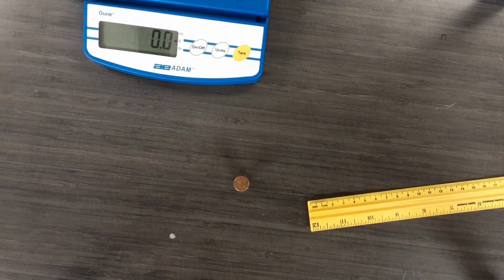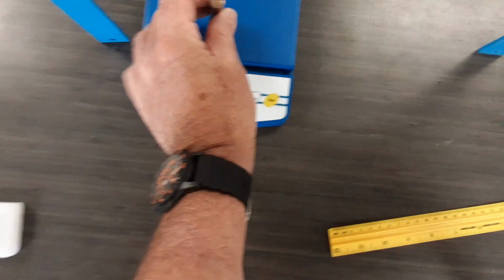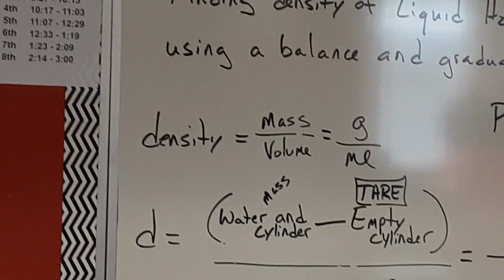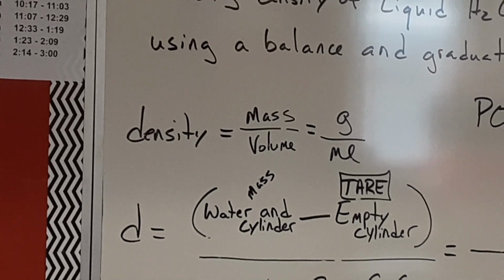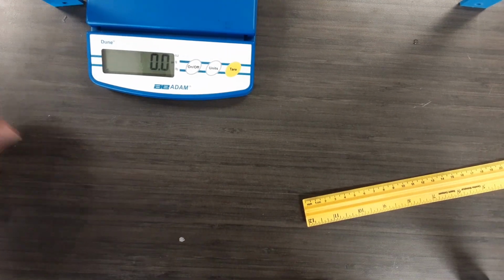So the formula for that will be, and we'll put this on your paper, pi r squared times height. And your volume for this, again, is going to be in centimeters cubed. You'll put it on the balance to get the mass, and then you will plug that very same data into the same formula, density equals mass divided by volume. The same formula for density is used every time we find density. All right, and now for the fun ones. Actually, those are all fun.